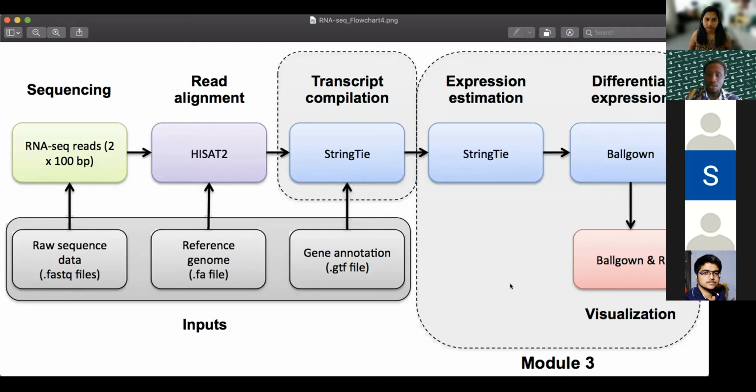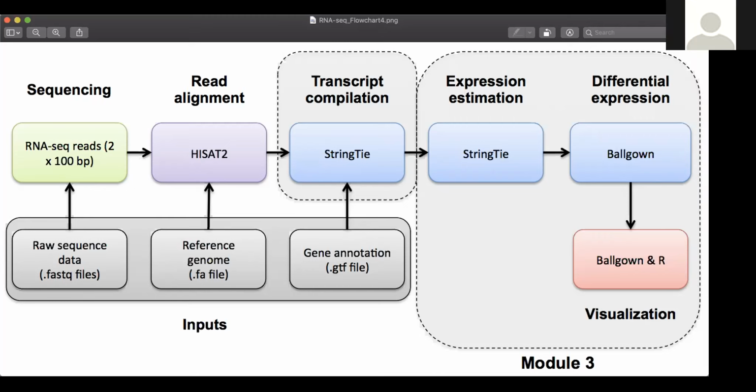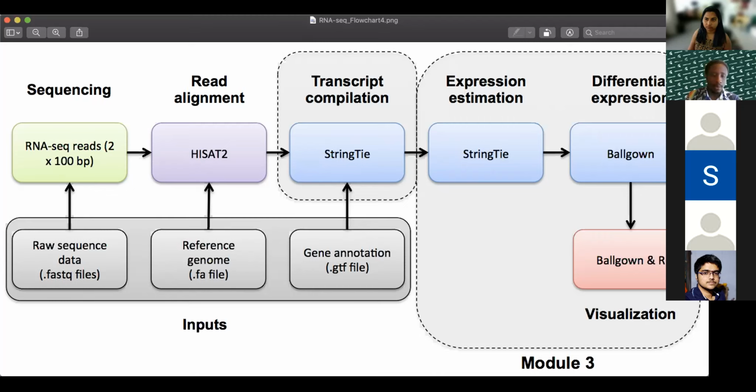And then after aligning the reads to your genome, you can look at your data set to see if there's some kind of contamination in your data set, by using, I think, a software like this. And then also understanding how the reads look like, right? And then after that, you can do some normalization of these reads, because most of these reads are very big numbers, and then you normalize your reads, and then you do your differential expression.